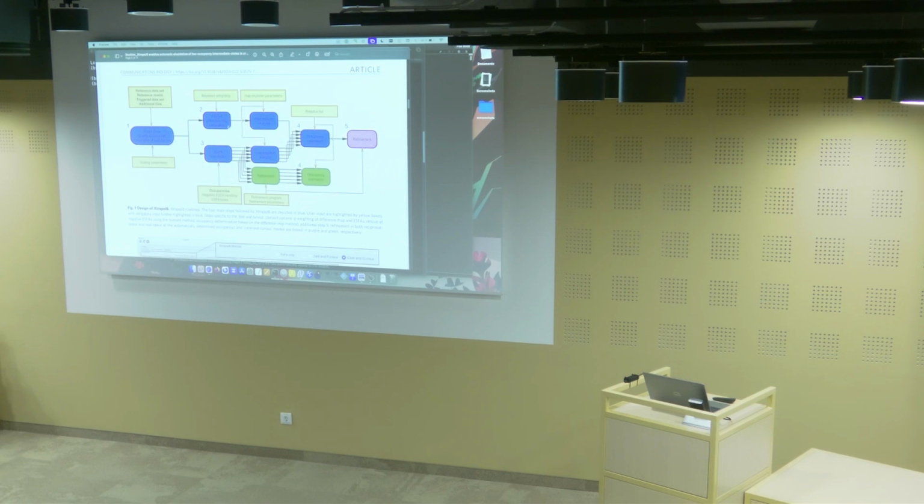Then we calculate the Fourier difference map, and we use a tool which we call Map Explorer to analyze the difference maps. Then we can calculate the extrapolated structure factor amplitudes. Again, we use that tool Map Explorer, and by comparing the output of the analysis of the difference map, we can estimate the occupancy. Now you can see these extrapolated structure factor amplitudes.